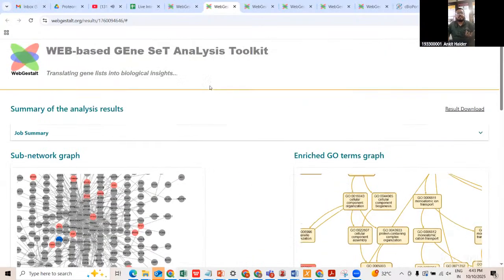So this is another way, as I mentioned, that you are expecting in the network topology analysis: to identify the different networks and how those networks can help us understand the gene ontology or the biological processes that are being altered or disrupted, and how much they are enriched or overlapping. In this way you can finally choose a particular pathway and try to inhibit it or understand the mechanism.